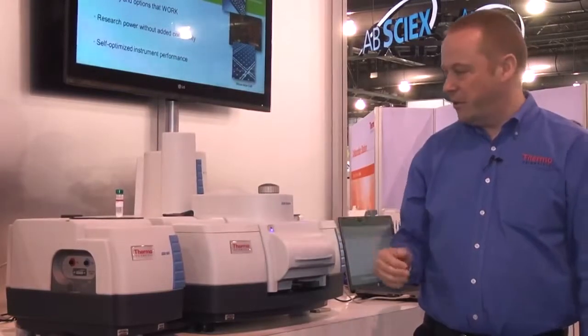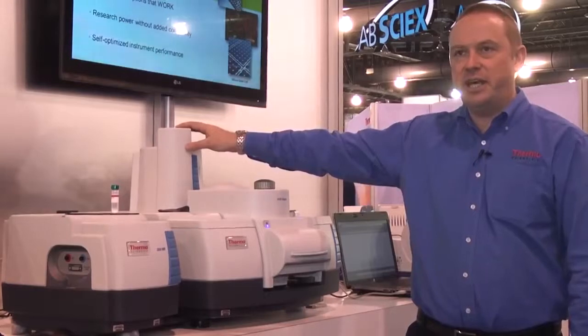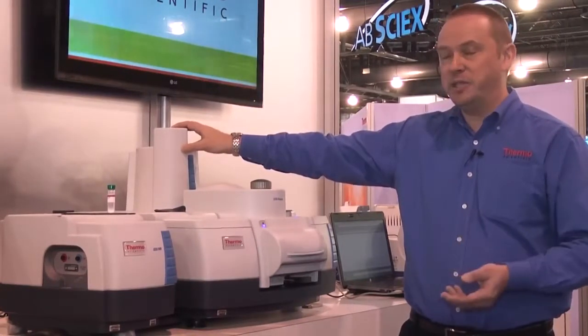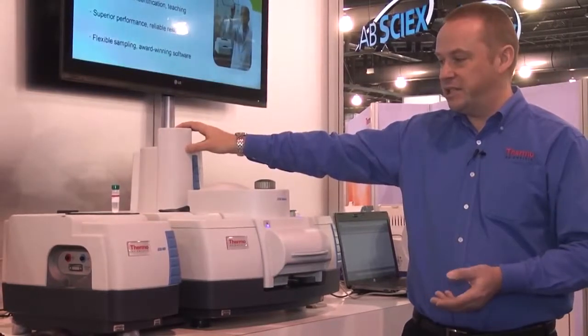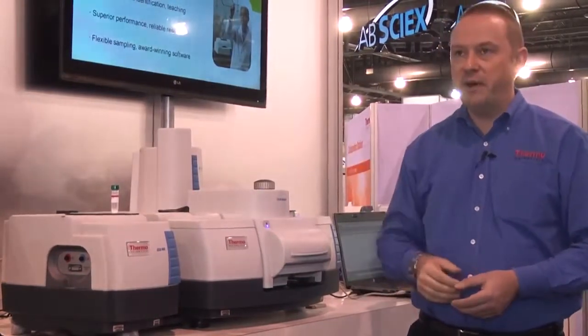The system also contains a beam splitter exchanger here, where we can change the wavelength range at the push of a button. So this particular system, we can go from near to mid to far infrared simply at the push of a button.